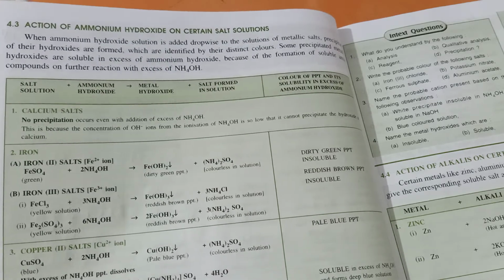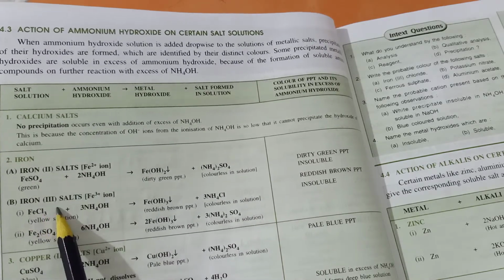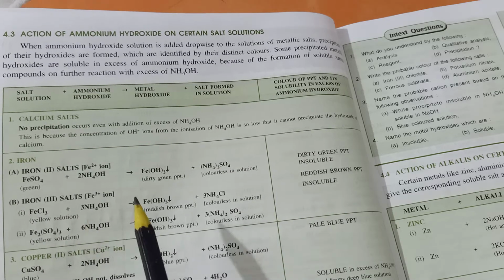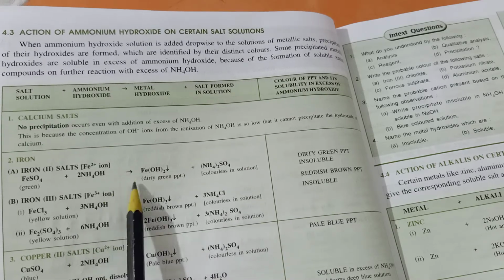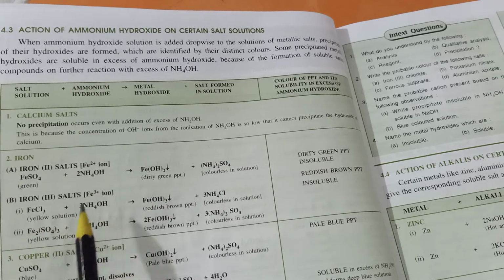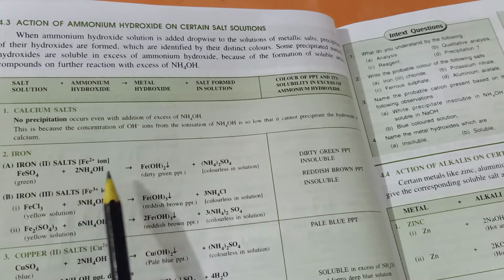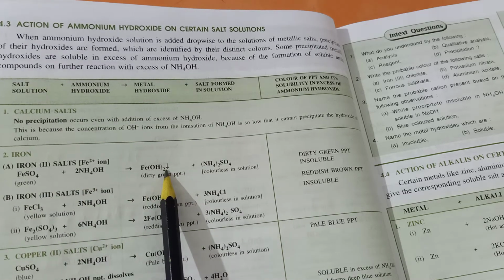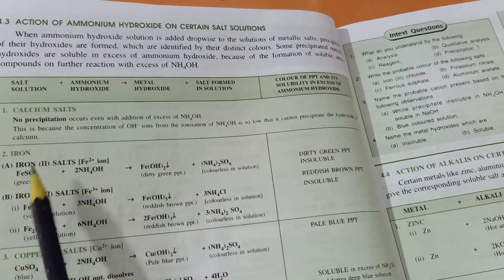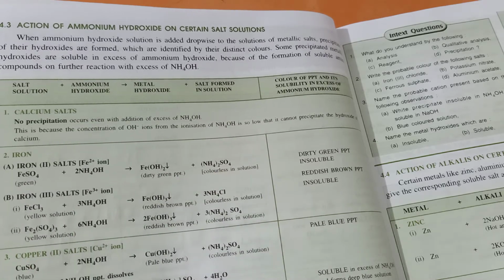Okay, let's move on to another metallic salt, iron: ferrous salt and ferric salt. Like the action of sodium hydroxide, ammonium hydroxide also forms precipitate of both iron salts, that is ferrous salt as well as ferric salt, and they have very similar reactions. So ammonium hydroxide will produce ferrous hydroxide. This is a double displacement, so they will exchange the ions, along with ammonium sulfate, which is a salt.